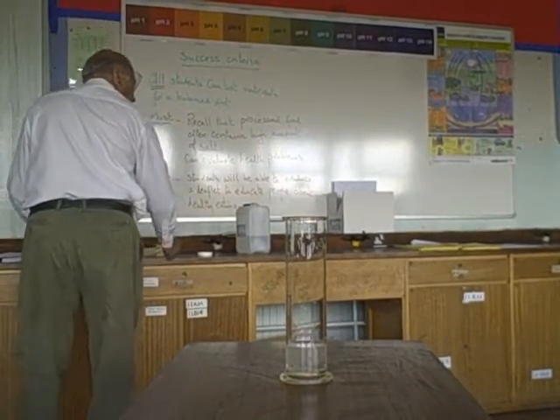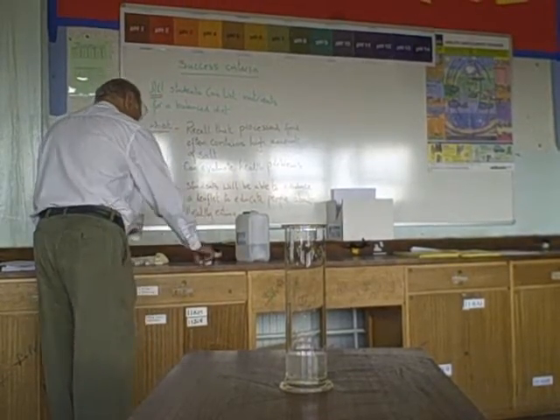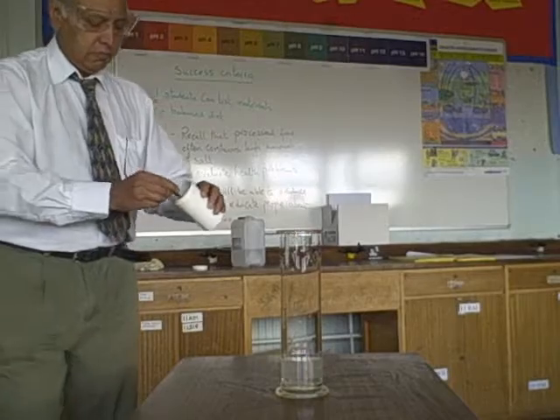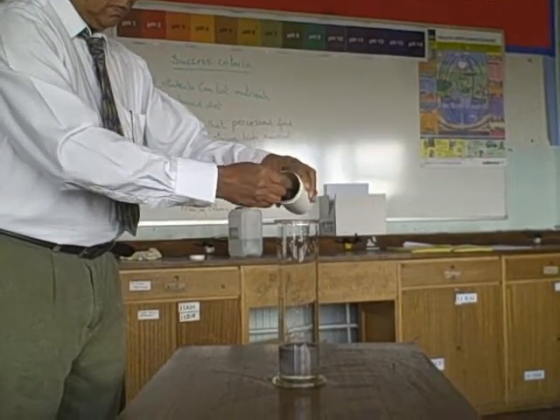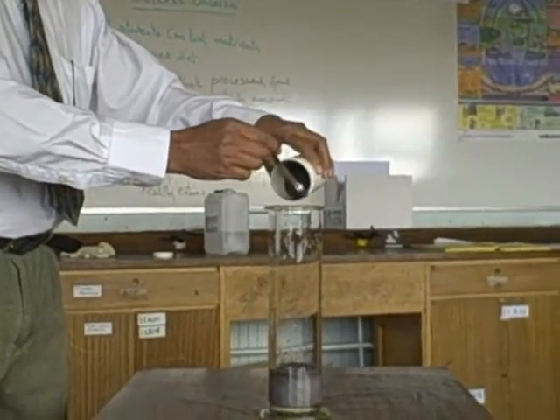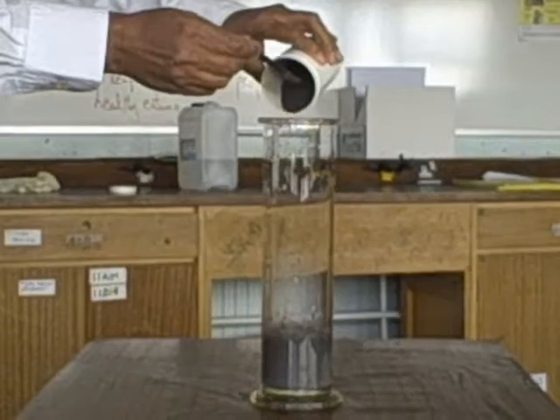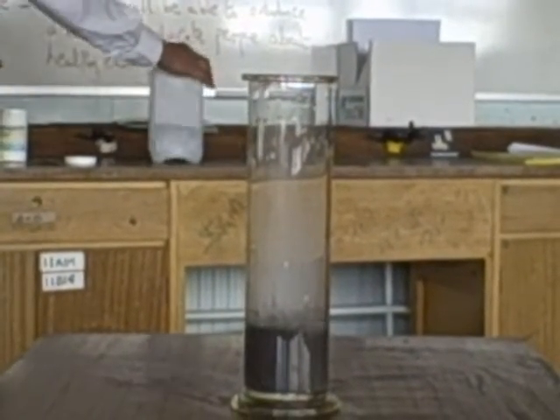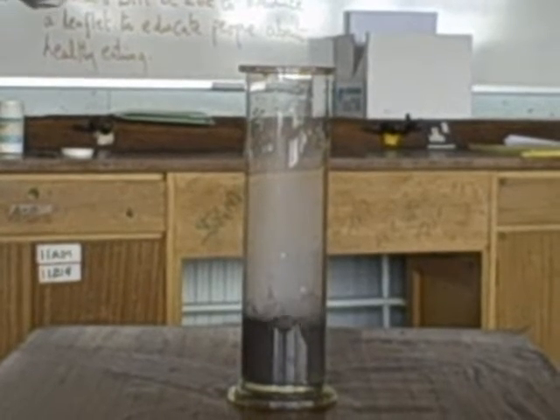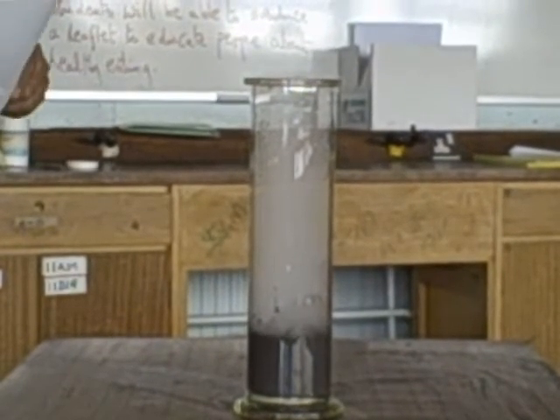You can speed up this reaction by adding a catalyst. The name of the catalyst is called manganese dioxide, and here some has been added. Straight away you can see the hydrogen peroxide is starting to bubble. These bubbles are caused by oxygen gas being produced as the hydrogen peroxide breaks down. You can also see a white vapour being produced, which is the water.